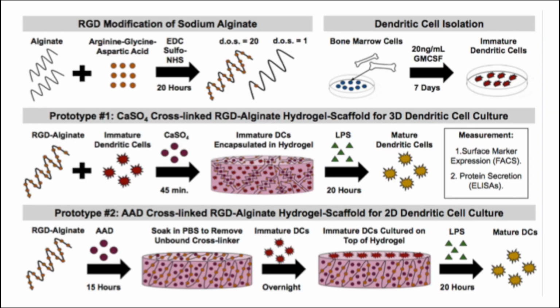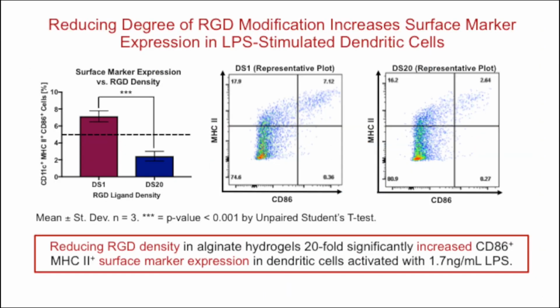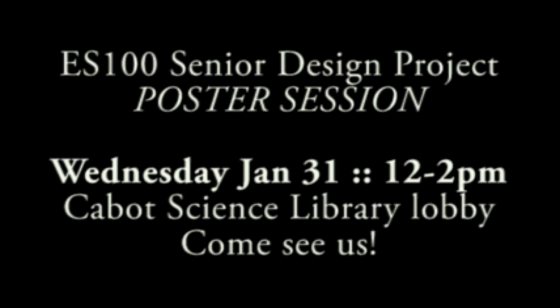For this purpose, I fabricated a hydrogel consisting of alginate modified with RGD adhesion ligands. By reducing the RGD degree of substitution, I observed a significant increase in mature surface marker expression and inflammatory cytokine secretion. These findings can be used to inform the design of more effective dendritic cell vaccines.